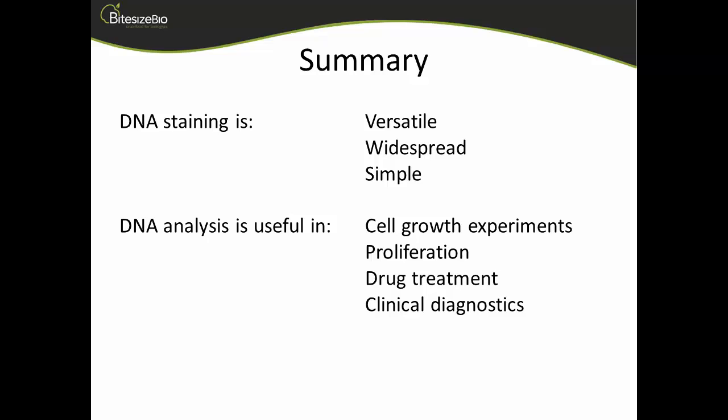Okay, so part of the reason why you get a spread of the data around G1 and G2 is to do with chromatin condensation, because not all cells in G1 have their chromatin in exactly the same conformation. That leads to this data spread. To target that specifically it is possible, but I think you'd have to spend a little bit of time working that up. Okay, great.